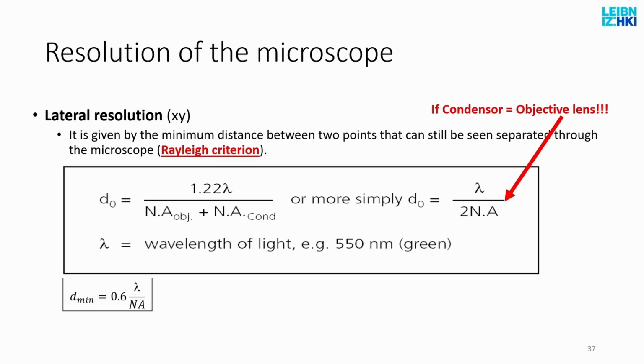But if your boss says, okay, then measure mitochondria, which are 1 micron, and you say, okay, I need a microscope where I can see at least several pixels per filament, then you can judge, can I do this or can I not? And you don't have to go to the net and check the objective lens specifically. You can just use this rule of thumb.